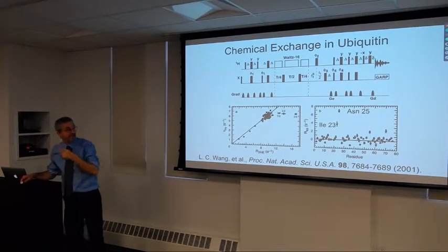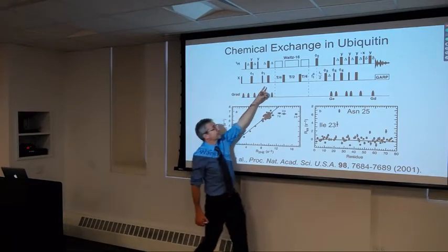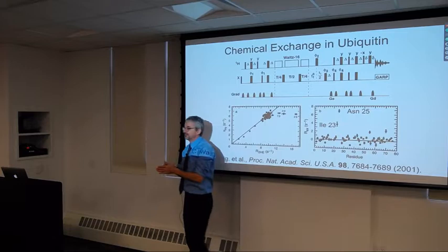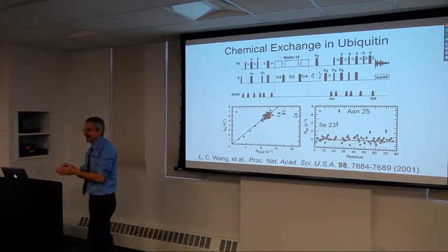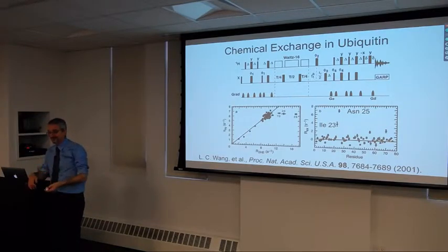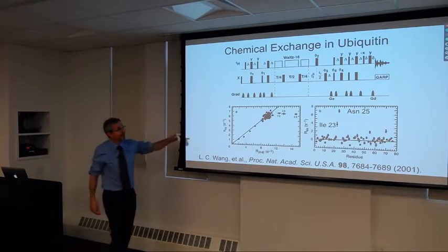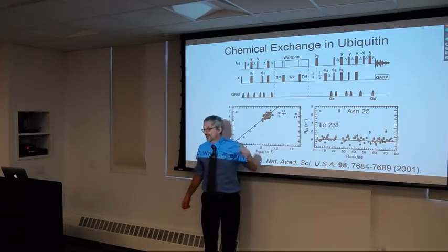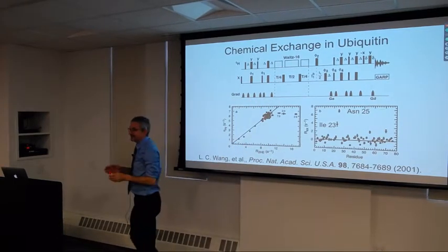So to avoid that, Waltz decoupling is turned on during these periods, and that prevents the J coupling from evolving, so the magnetization is locked as in-phase magnetization. One has to worry then about imperfections introduced from the Waltz decoupling, so one has to pick a value of T over 4 so that an integral number of the Waltz cycles happen during that period.